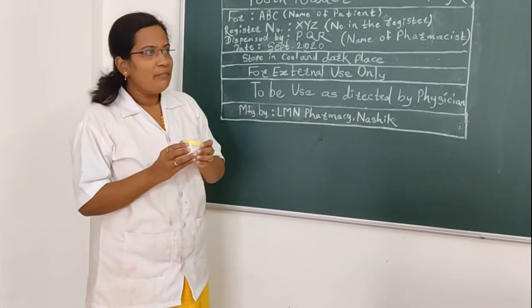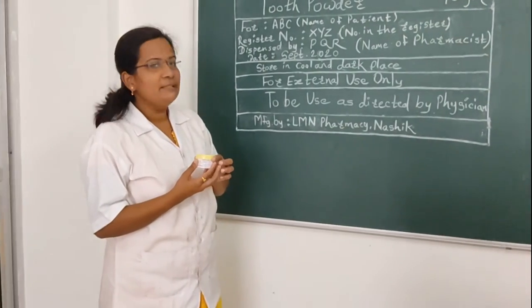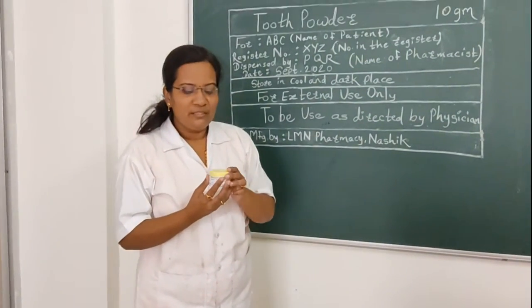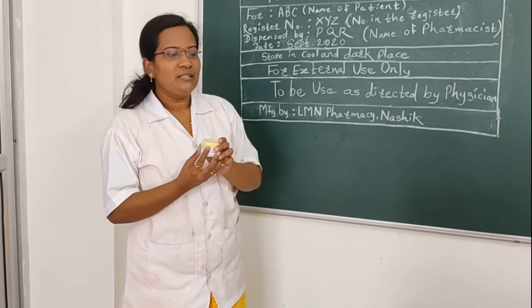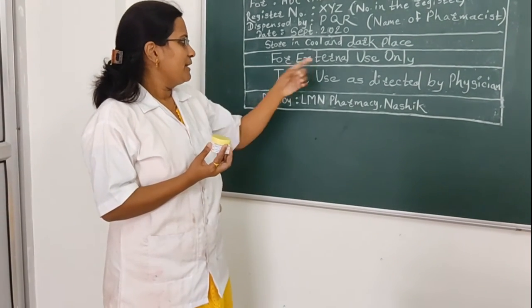Result: the 10 gram of the tooth powder is dispensed in this wide open bottle for inspection, with the special instruction on the label as for external use only.